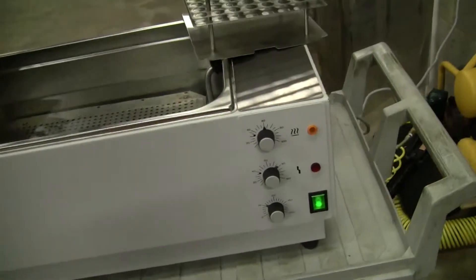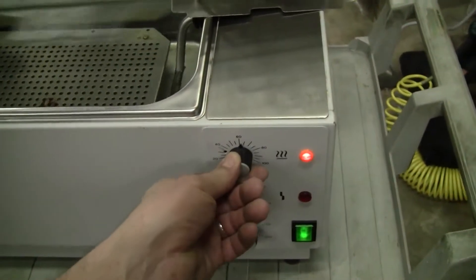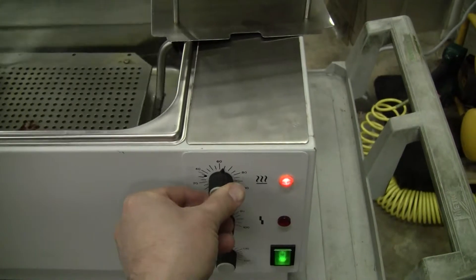Very simple unit. We have it heating. That's up to about 61 degrees right now.